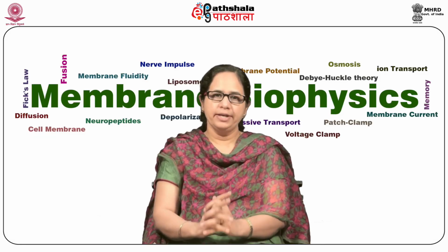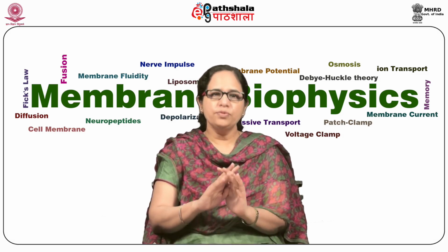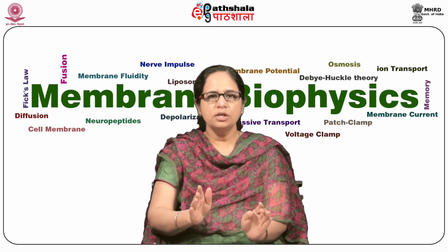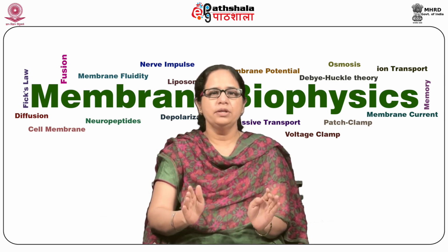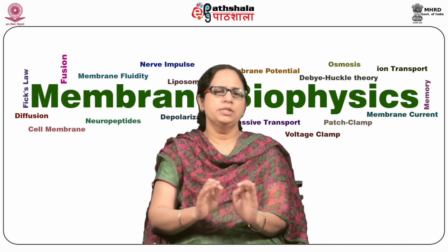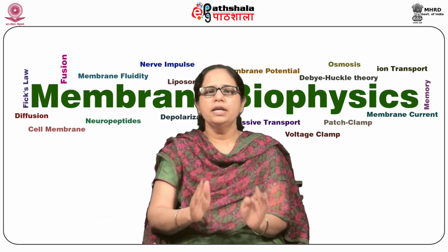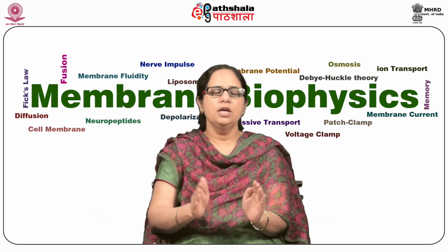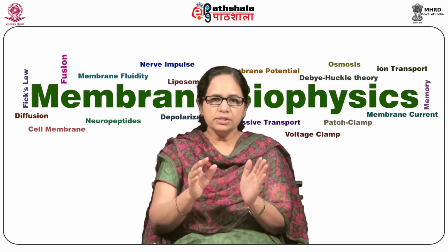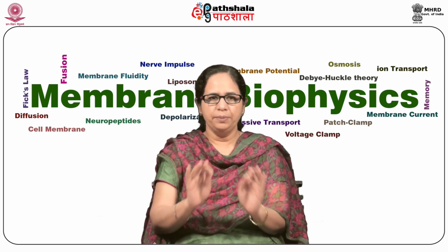Now coming to the patch clamp recording. It is a marvelous technical breakthrough that improves the signal to noise ratio of the recording. It records from whole cells or from a small patch of cell membrane, so only a few channels or even a single channel can be studied. The high resistance, or gigaohm seal, and high mechanical strength of the seal between the glass electrode or patch pipette and the cell membrane enable one to observe very small currents even at picoampere scale.